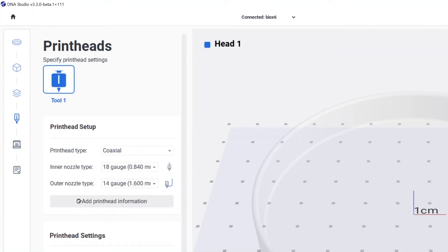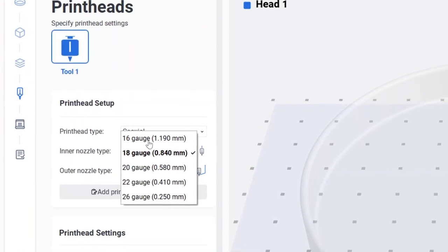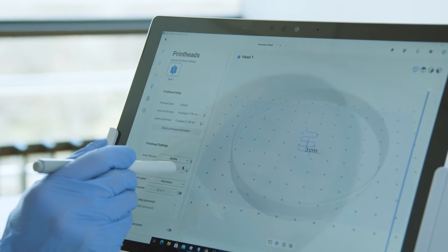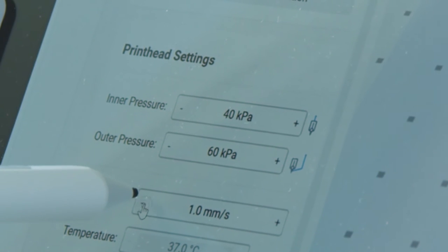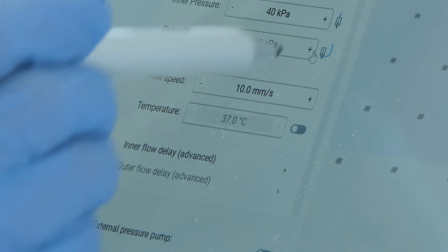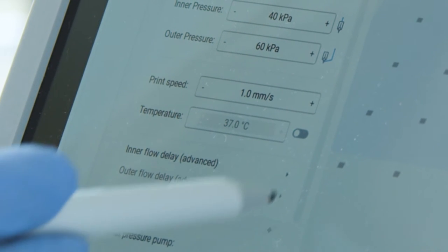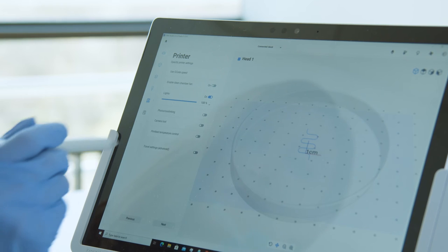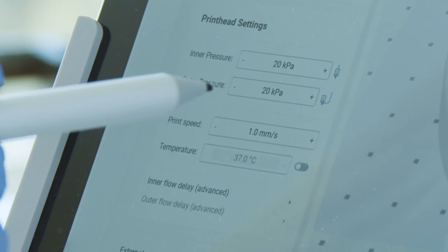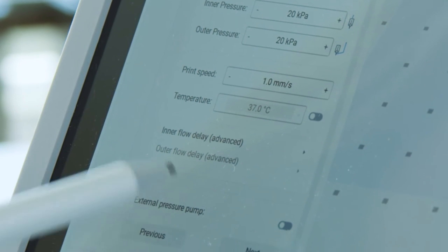Select the size for the inner nozzle and outer nozzle based on the gauge size written on the surface of the nozzle. Here you can adjust the pressure for the inner and outer nozzle. Then adjust the print speed — I recommend starting from a low print speed, usually one or two millimeters per second, which works well for different bioinks. You can further adjust during the bioprinting process as well. You can also adjust the temperature here, and if you would like to have an inner or outer flow delay, select that option here.